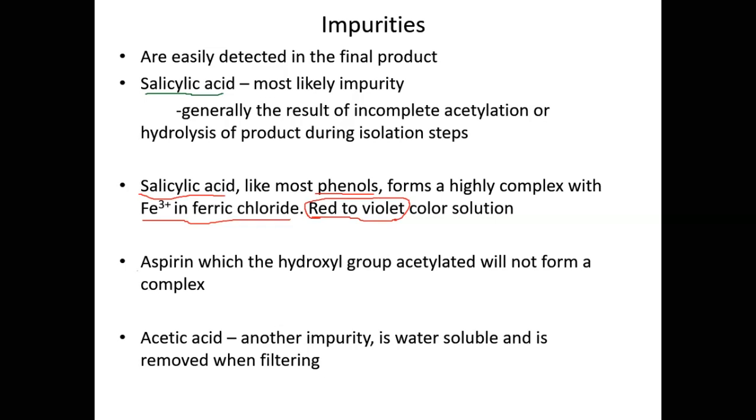Now, aspirin won't react with ferric chloride because aspirin has no hydroxyl group. So there's no hydroxyl group in aspirin. So if your ferric chloride solution changes color when you add your product, that indicates that you have some salicylic acid left in the solution.